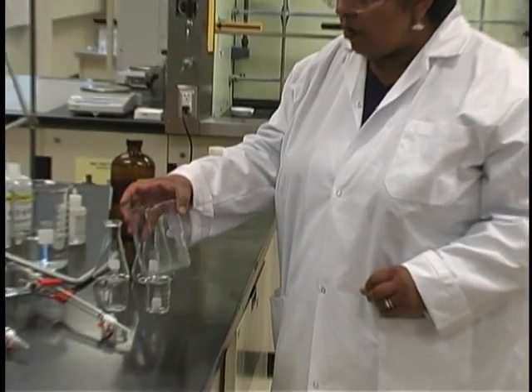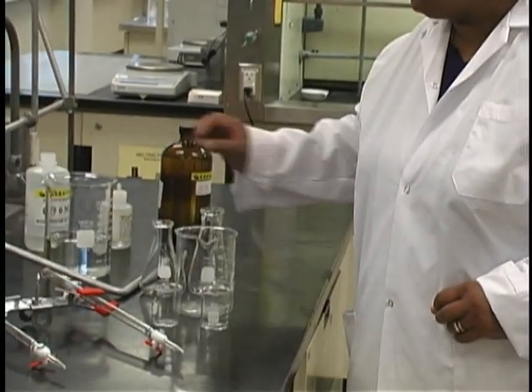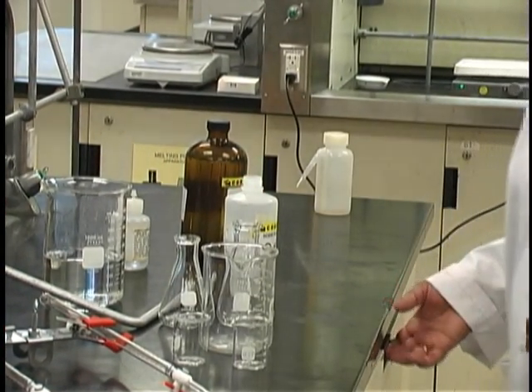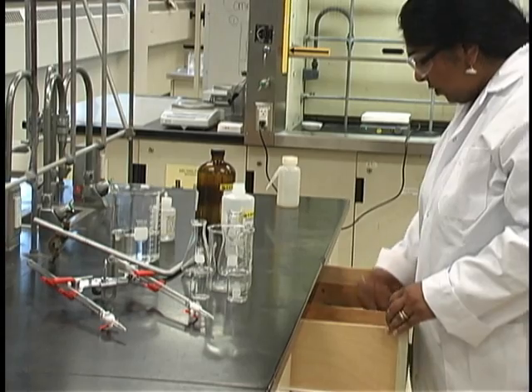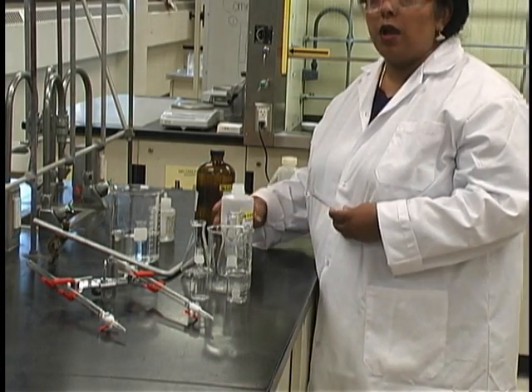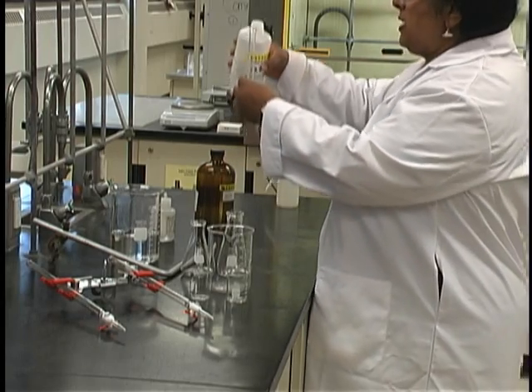To prepare your own NaOH solution, obtain the concentrated sodium hydroxide solution, 6 molar, and use a 10 milliliter graduated cylinder to measure approximately 8 or 9 milliliters of this base solution.